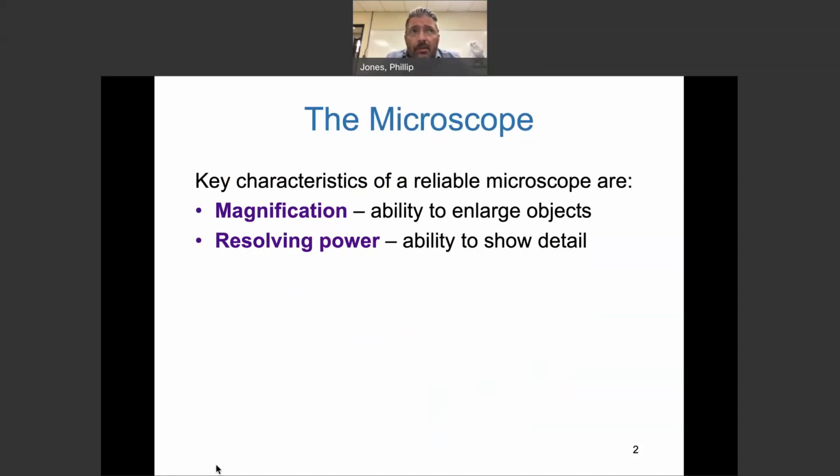And then about 6 of you asked me, what does TM mean? And I said total magnification. And you guys said, well, should I just write it down? I said, no, I think you should write down 10 times or whatever over and over again, figuring out what your total magnification is. So if on a lab practical or an exam, they ask what's the total magnification, you would automatically be able to say, okay, it's ocular times objective, and figure that out.